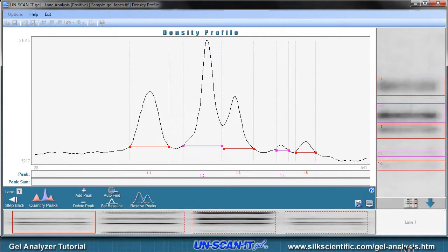The Unscannit Gel software will then analyze each lane and allow you to quantify each of the bands. Since we are using lane analysis mode, a density profile screen will be displayed for each lane. General information regarding the density profile can be displayed by clicking the question mark button at the bottom of the density profile.